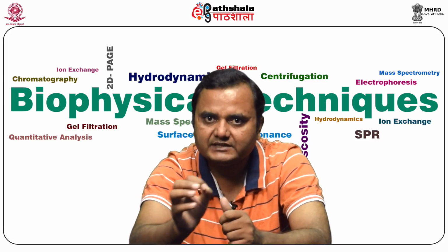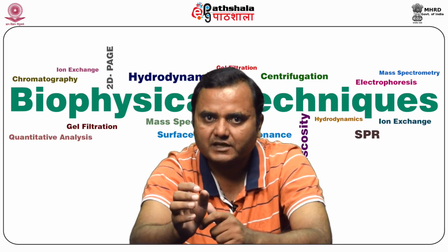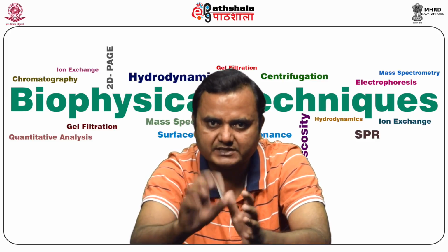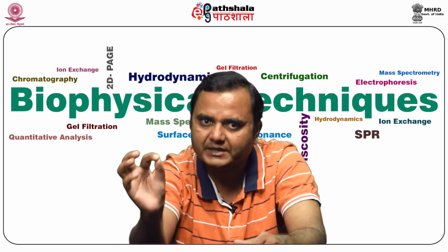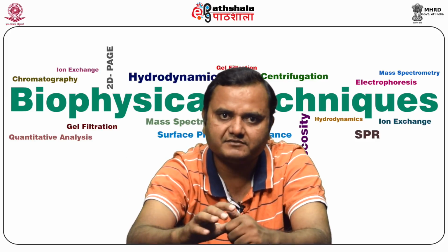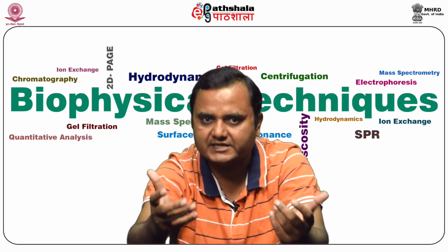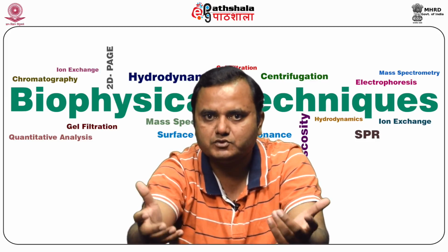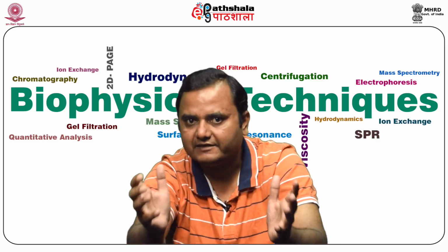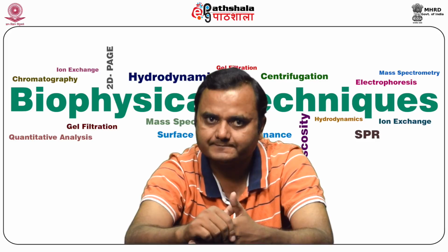It prevents the sedimentation of molecules with densities less than the medium. By controlling the time and speed of the centrifugation, significant purification can be obtained. Since most macromolecules have greater densities than this medium, separation is based on the S value, so it can be used to separate molecules with relatively close S values in the sucrose density gradient.